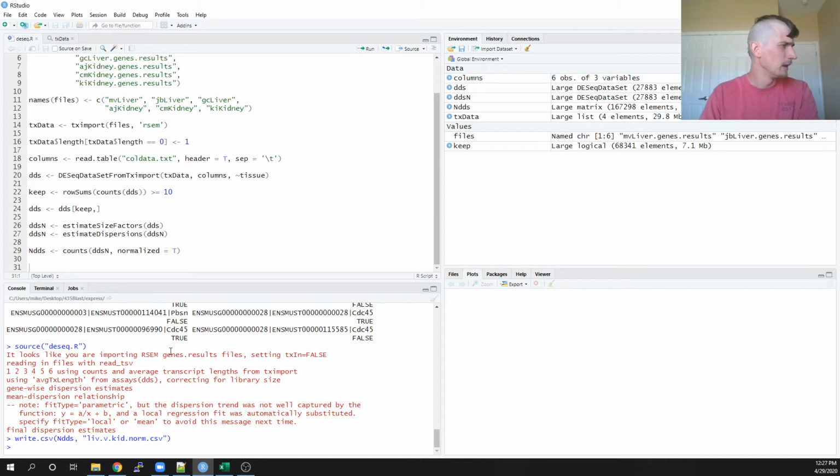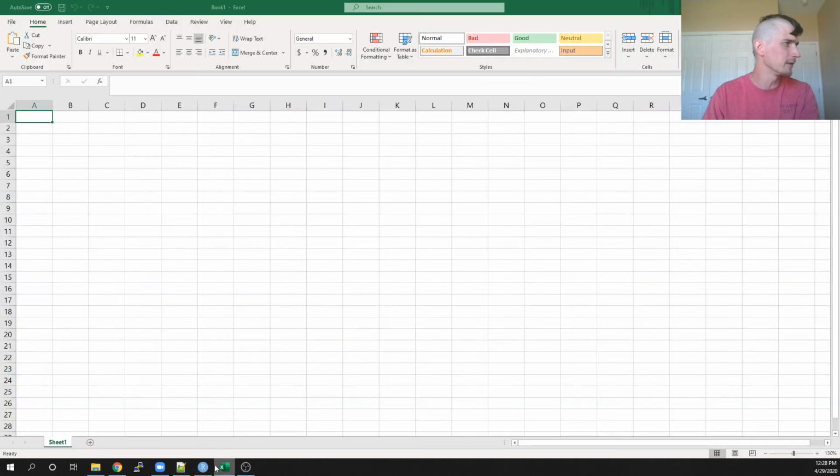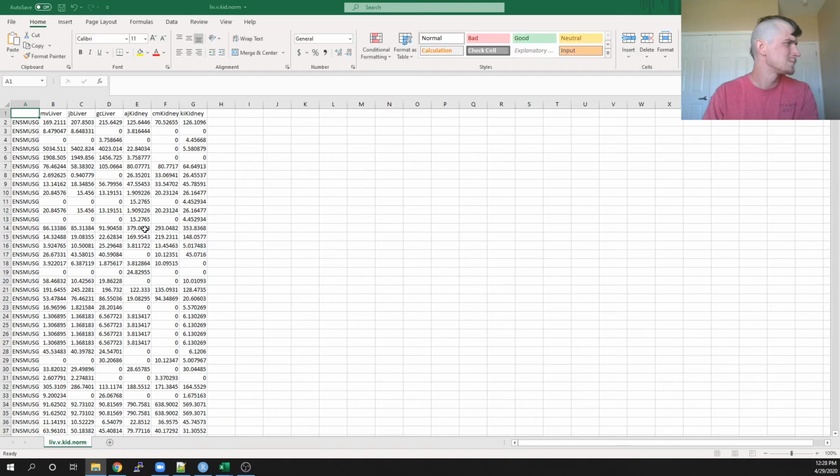Okay. And so a CSV just stands for comma separated. I'm going to open this up in Excel real quick so we can look at it. Okay.